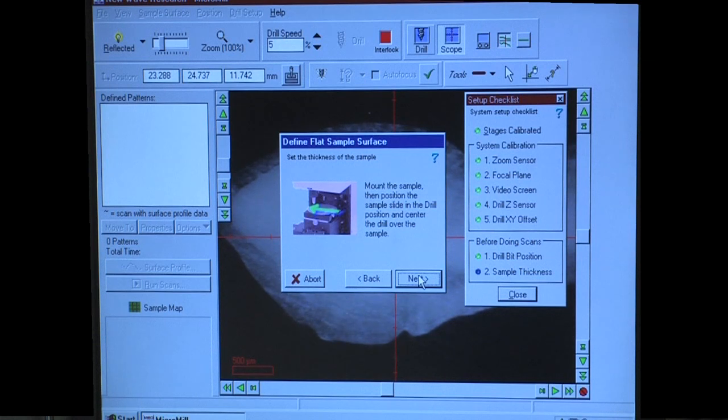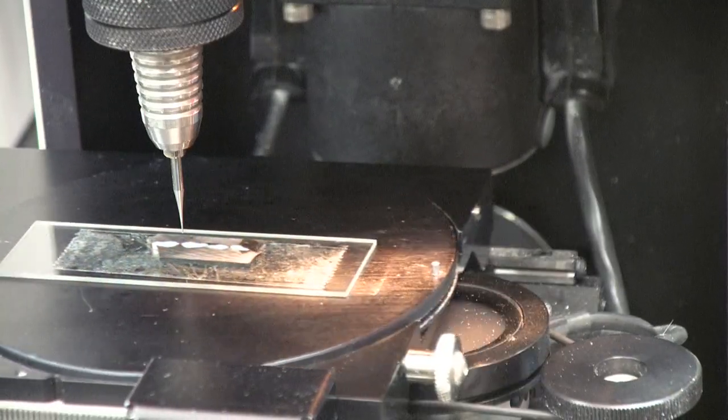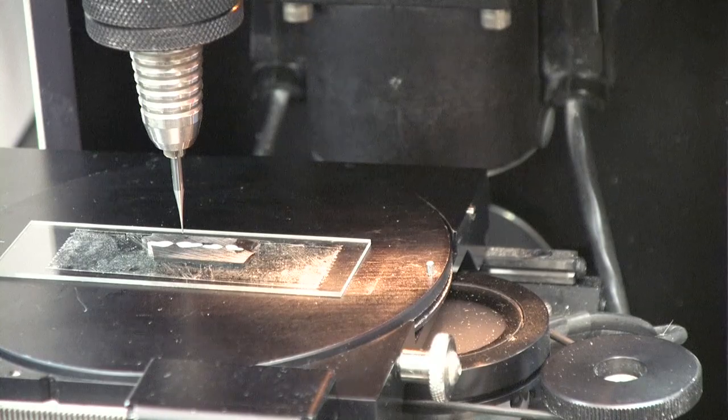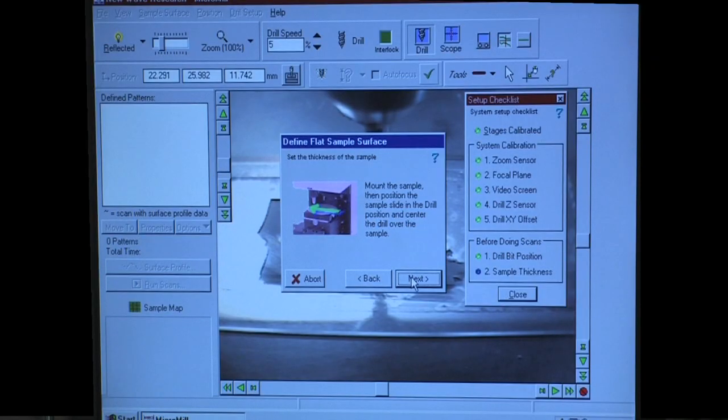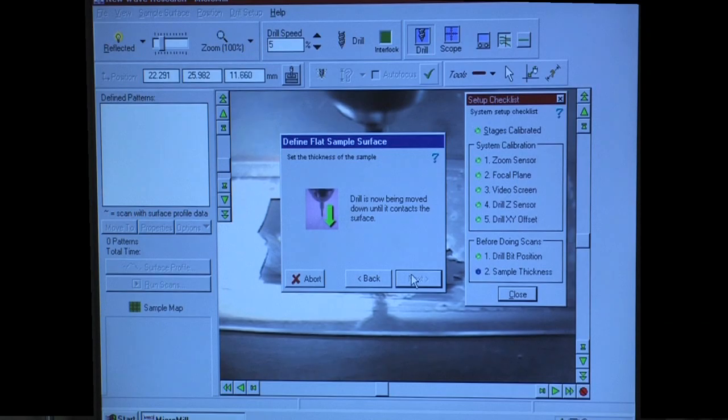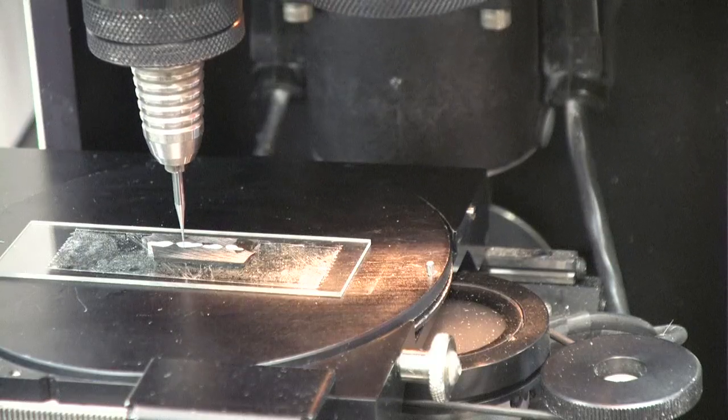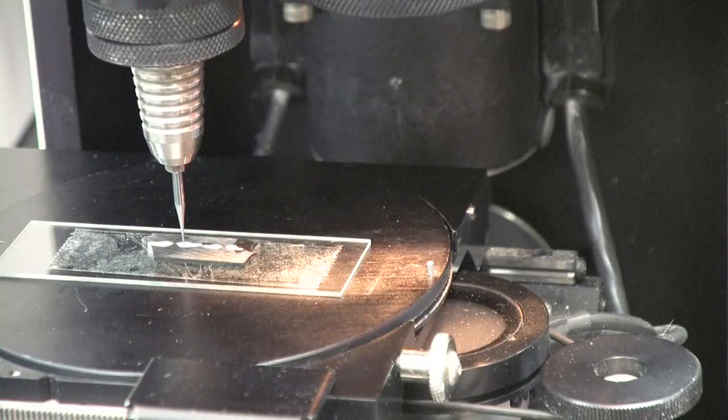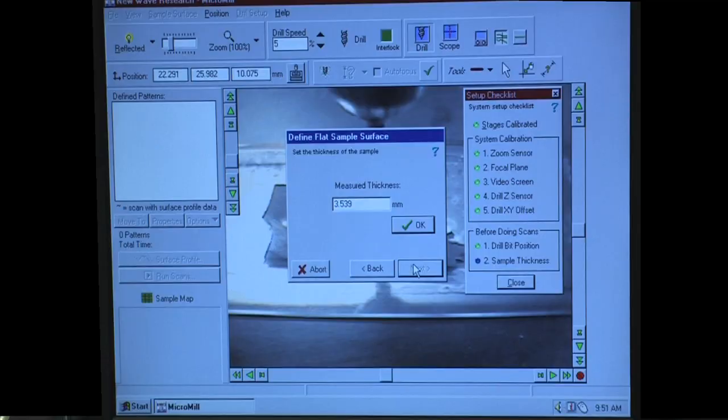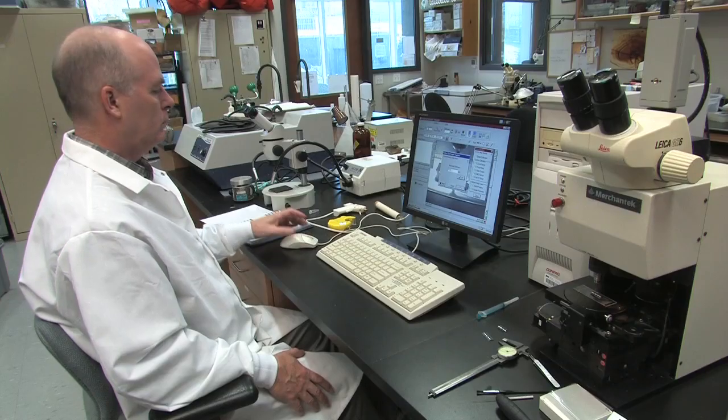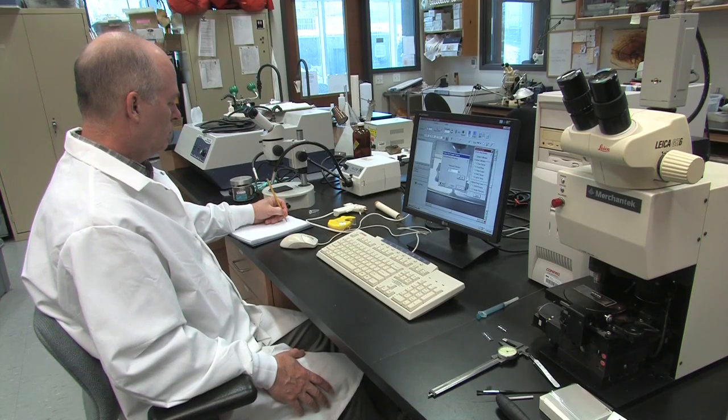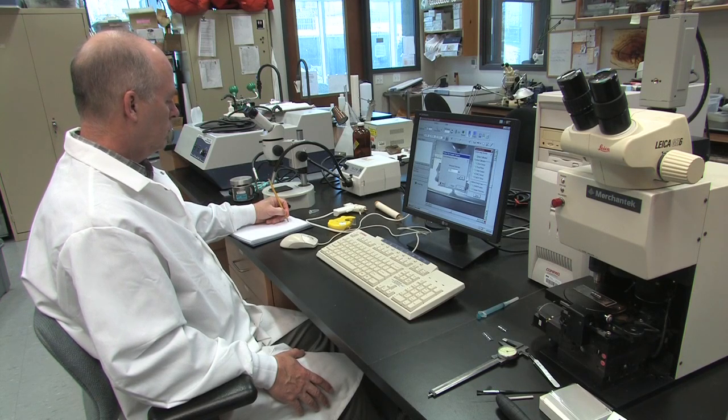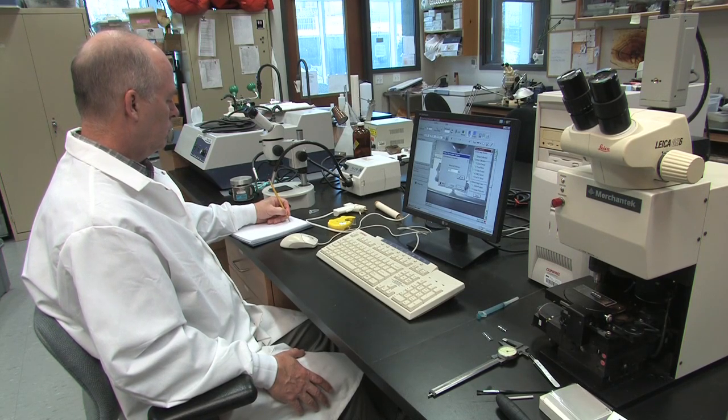In the next prompt window, move the sample over to the Drill Camera by pushing the Drill Camera button at the top of the screen, and then push Next. The Micromill will then move the Drill Bit down so that it just touches the surface of your sample and will take a measurement. Record the sample thickness measured. The sample thickness will be the total value of your sample, the tape and the glass slide, or everything between the tip of the Drill Bit and the Stage Plate.